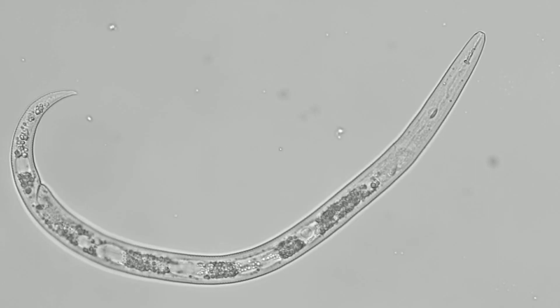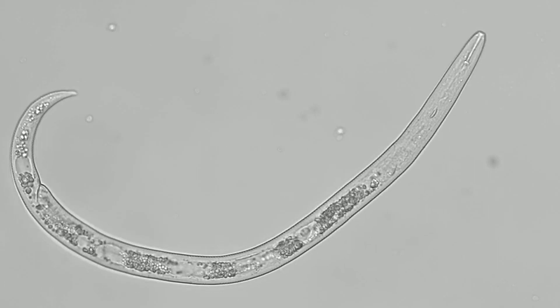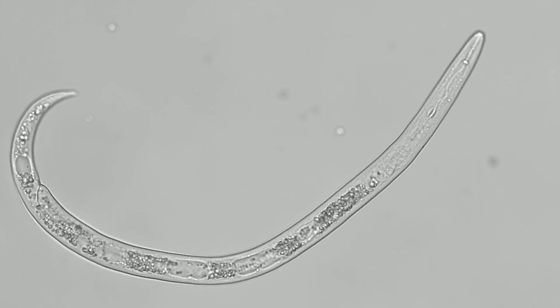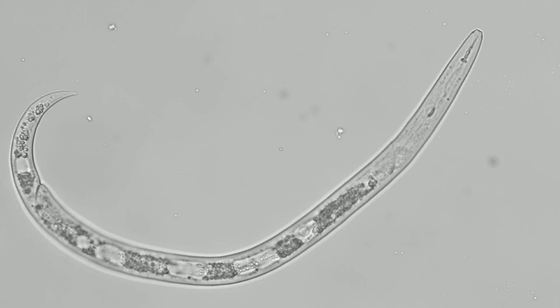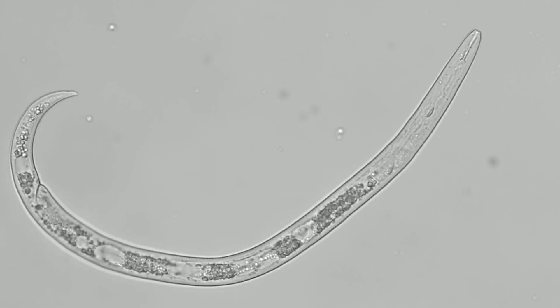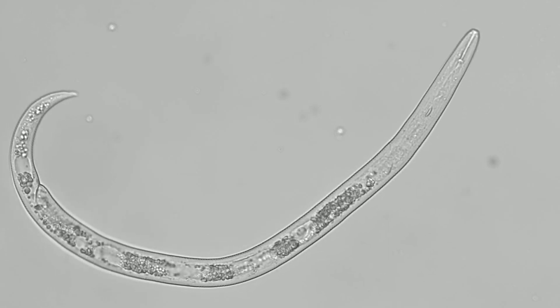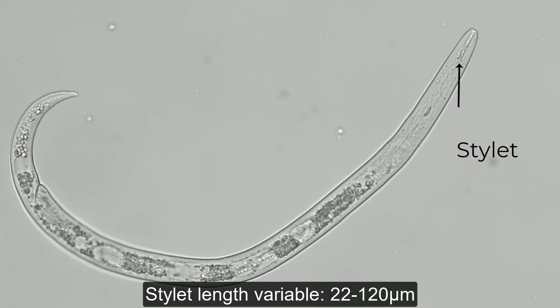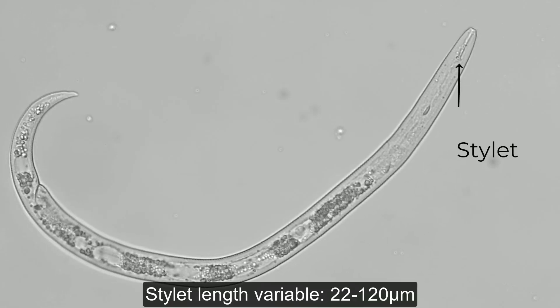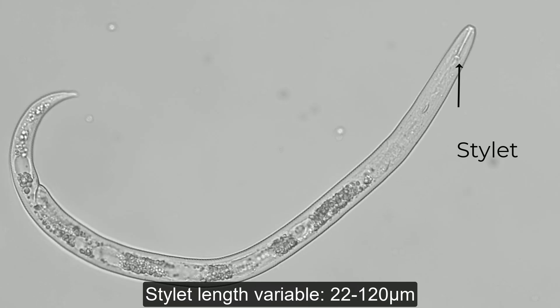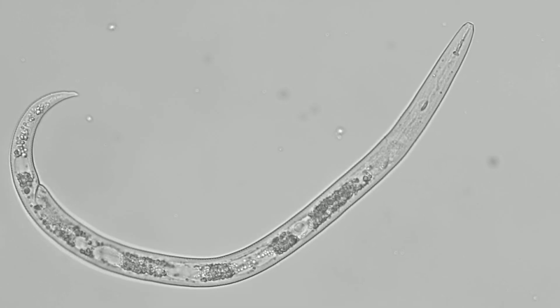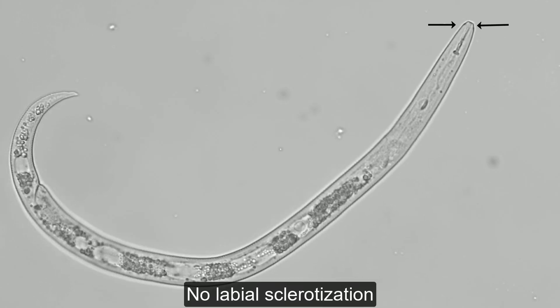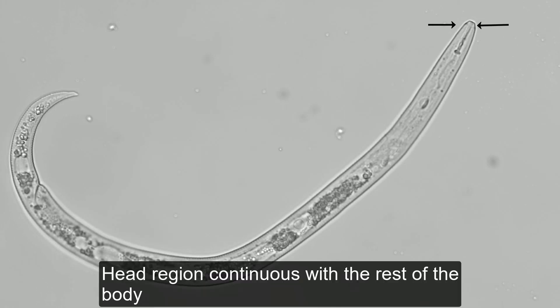However, due to the limited diagnostic features within this genus, there is no other unique feature to observe. We can however still observe the stylet, which in this case is short. We can also see a continuous labial region and a weak labial framework.